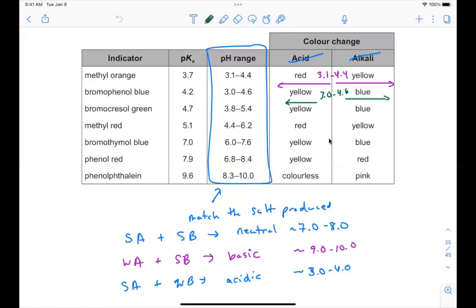Yes, let's assume. Okay, so let me rephrase that. Let's assume we're going with the neutral salt. Let's assume the salt is 7. Can you think of a reason why we would look at phenolphthalein versus bromothymol blue or phenol red, more practically speaking, not chemically speaking? Why do you think we would have you do phenolphthalein instead of these other two? Think about what you're trying to identify.